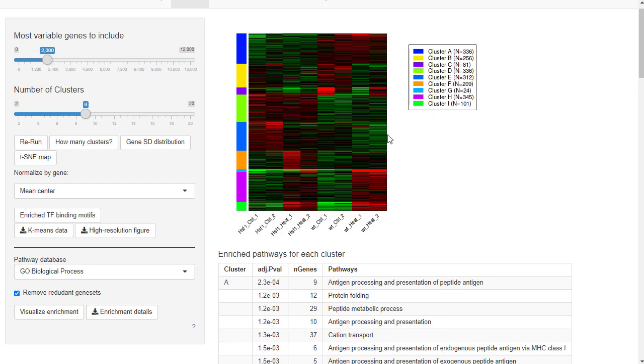This is actually a very, very interesting kind of pattern. This group of genes are highly expressed in the mutant without treatment. With treatment, this group of genes are downregulated. In the wild type, these genes have much lower expression, and lower still upon treatment. So this is an interesting group of genes, in the sense that it's specifically upregulated in this one sample out of 4.